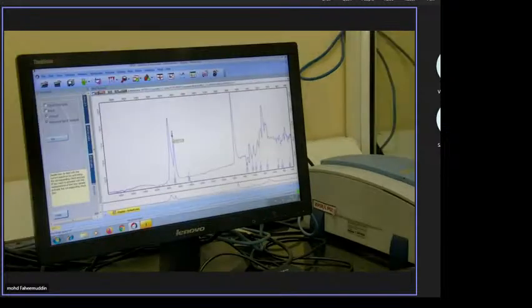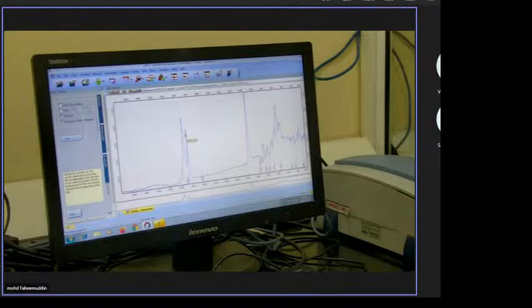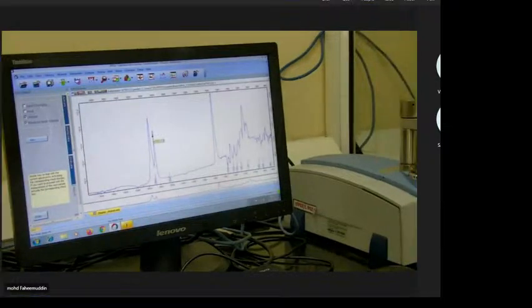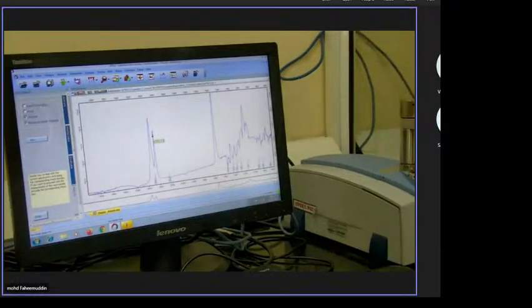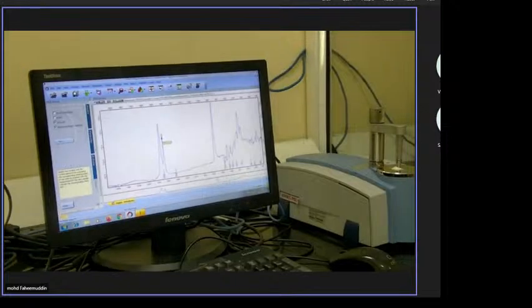There should be clear peaks of all the peaks for HPMC and all the peaks of metronidazole. Even for the drug combination, these peaks should not be disturbed. If a peak is disturbed, it means that particular peak is interacting with some other component, so that functional group is blocked.